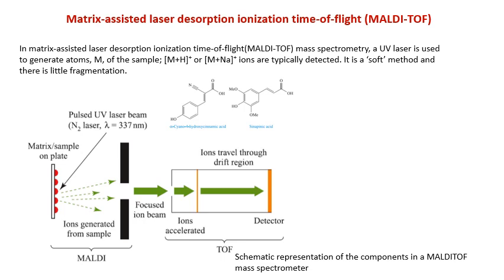Coming to matrix assisted laser desorption ionization time of flight, MALDI-TOF. In MALDI-TOF mass spectrometry, normally a UV laser is used to generate ions, and M plus H or M plus Na ions are typically detected in this technique. It is a soft technique because little fragmentation takes place.